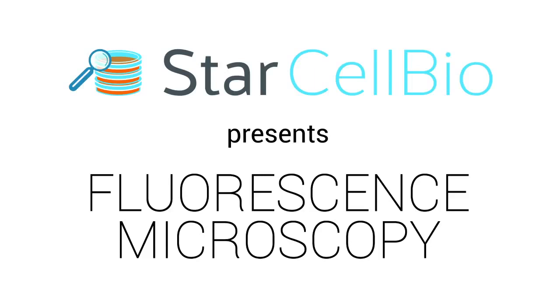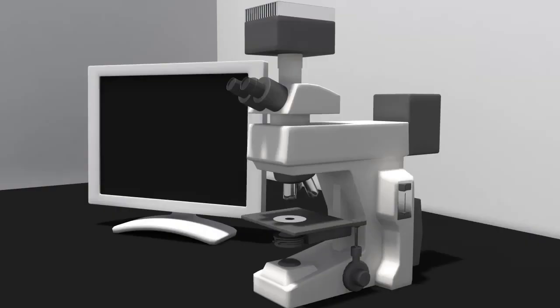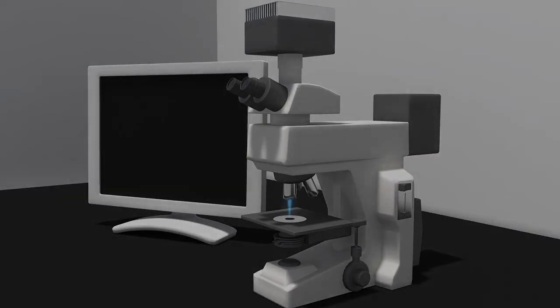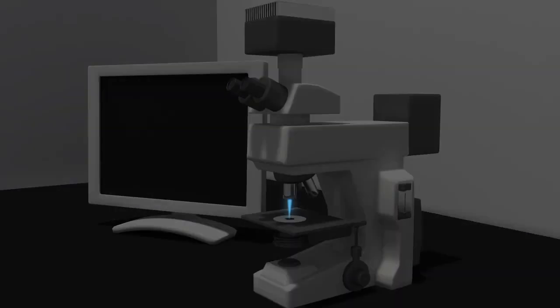In this animation, we will introduce you to fluorescence microscopy. Fluorescence microscopy is a special type of light microscopy in which the microscope uses a laser as the light source.